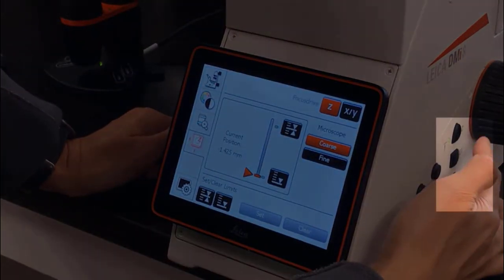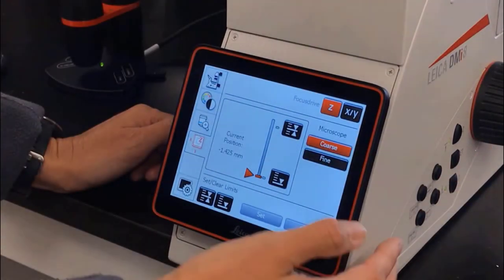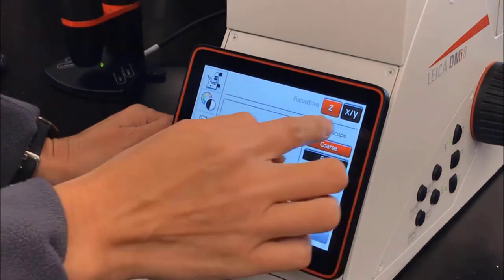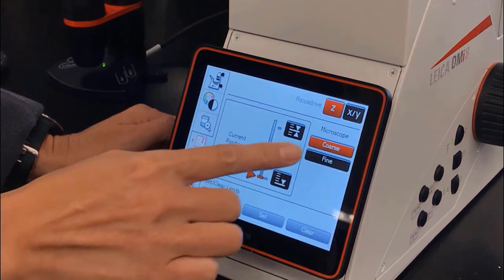You can also use the side buttons to toggle between focus and the lower limit, and you can toggle between coarse and fine focus using the touch screen.